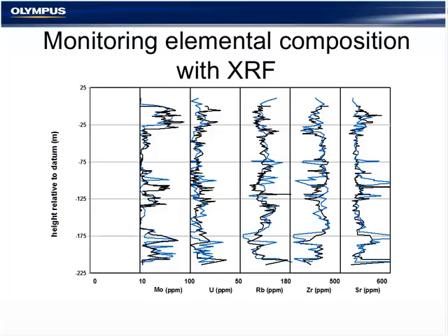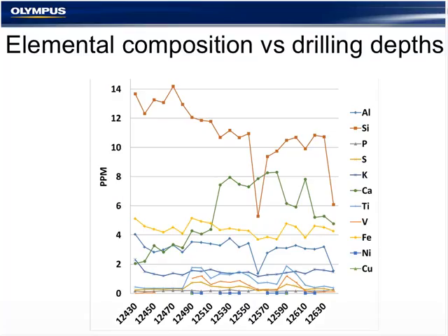Next slide. For example, back to those trace metals such as the nickel or the vanadium or the uranium. These are all well known to have been deposited in conditions that represent persistent anoxic or euxinic environments, which are very important for the preservation of high amounts of organic matter. These trace metals are often concentrated in the shales. The correlation of elemental XRF with XRD helps also to verify the quantitative mineral interpretation and for your clay types.